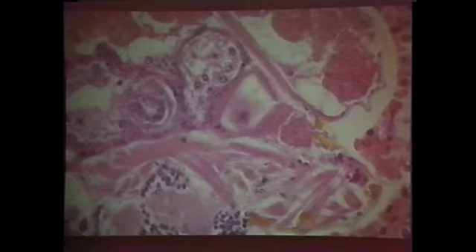Here we go. Look at these areas, they are highly chitinized. But if you go on high magnification in areas like this, you will find that the muscle is striated. Remember, I never used striated muscles so far. This is the first group that we've seen that will have striated muscles. Here we go, and you can pick it out right in here. Those are the little H bands, Z bands, I forget my numbers.